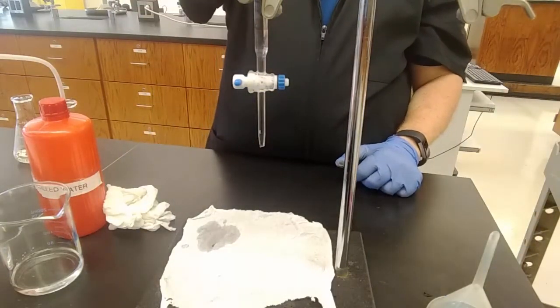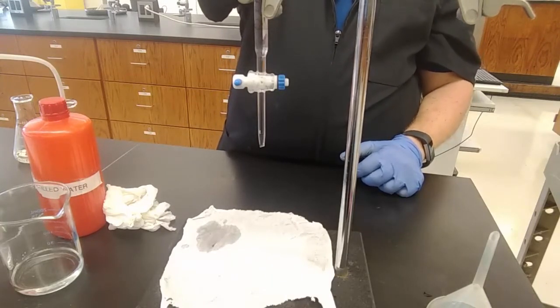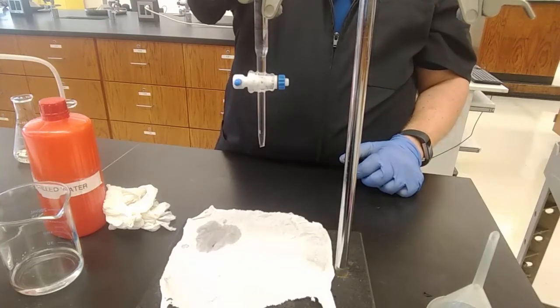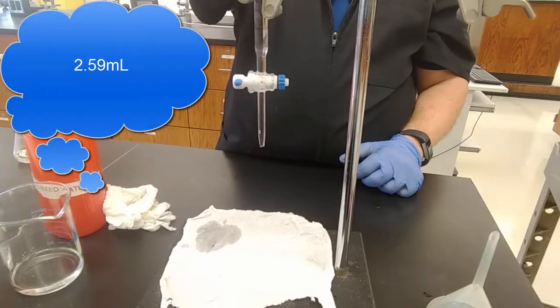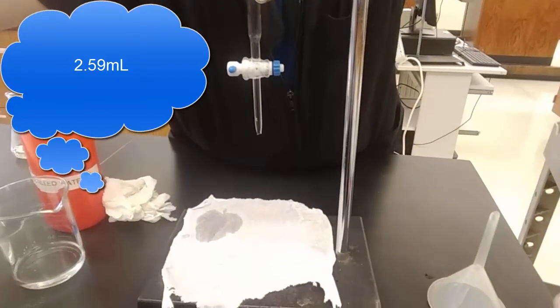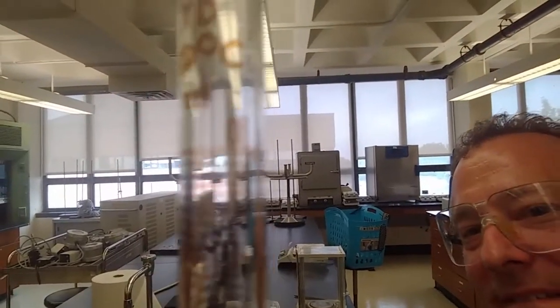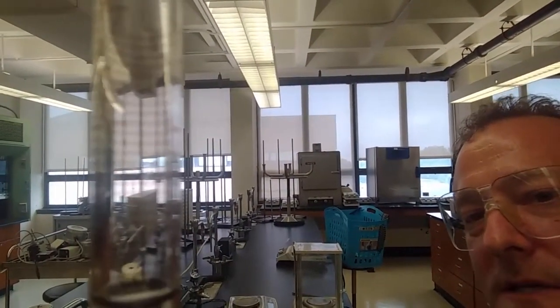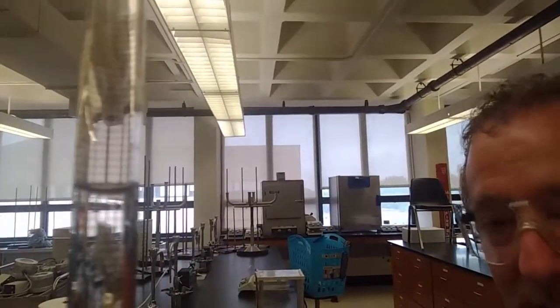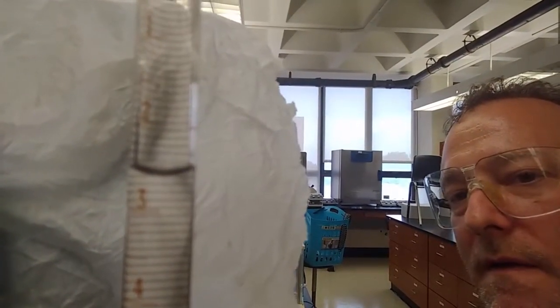And I'm going to get my initial reading, which is between 2.5 and 2.6. 2.59. Yeah, 2.59 is my starting value the second time around. Let's see if I can give you the meniscus. Yeah, I don't think there's going to be any way for you to tell, but I'll try giving it to you. 2.59.